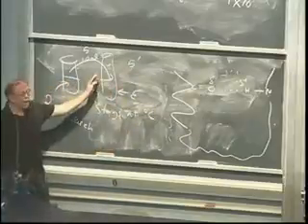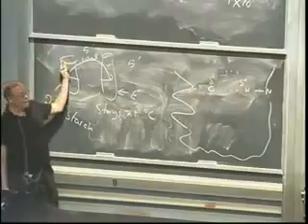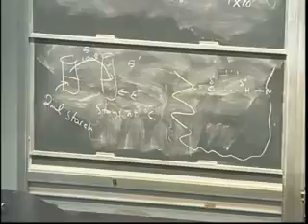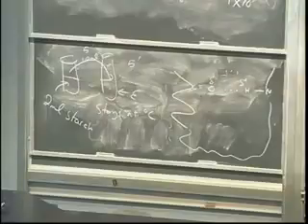For 5 minutes, you'll pull it out, add DNS at room temperature, it stops the reaction. So this allows those solutions to come to the same temperature so that when you start timing, they're there. Okay? Because if I took a tube at room temperature of starch and I added it to the enzyme and then I put it in a refrigerator, it does not instantly get to that temperature. So I have to make sure they're both at the temperature.